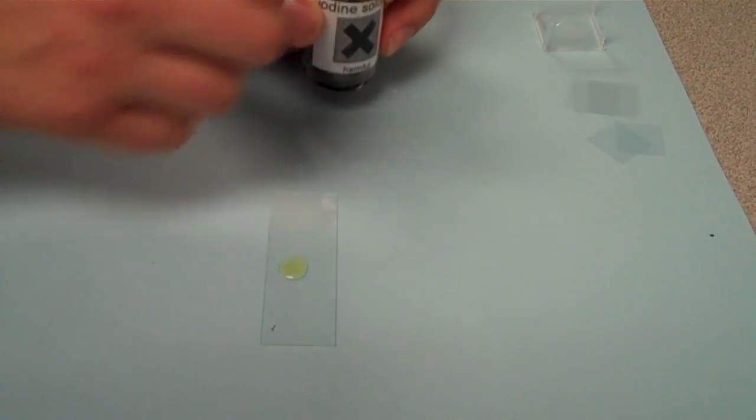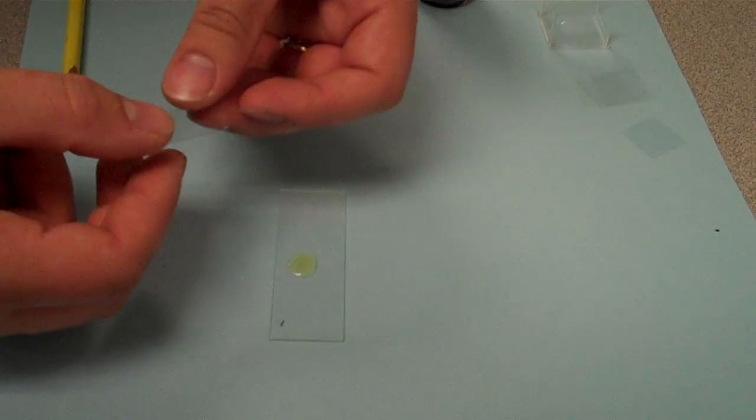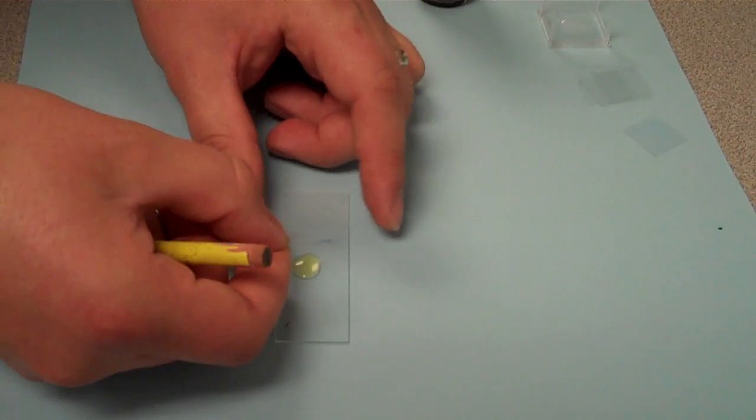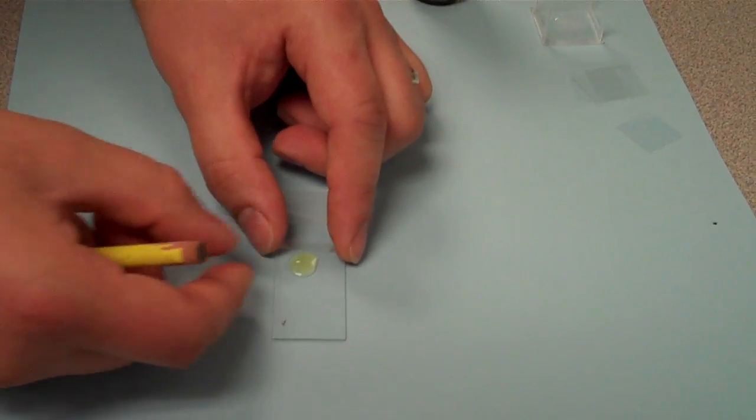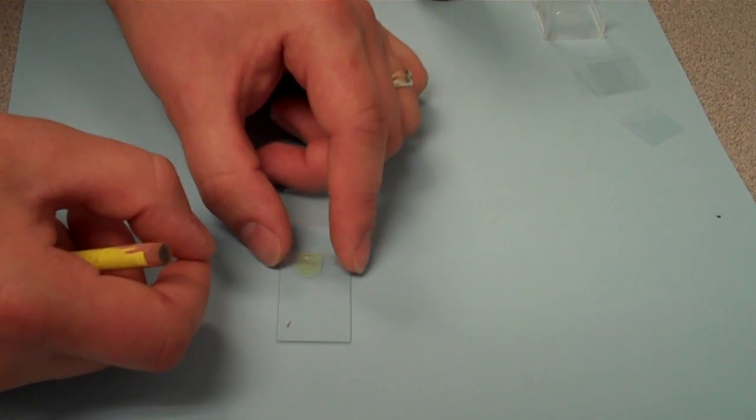Alright, that's probably a little bit much. Alright, then we take a cover slip. Again, if it's a new one, we don't have to clean it. If it's an old one, just wipe it down with alcohol. If you take it with one hand, and position it just so that the back end touches the water droplet.